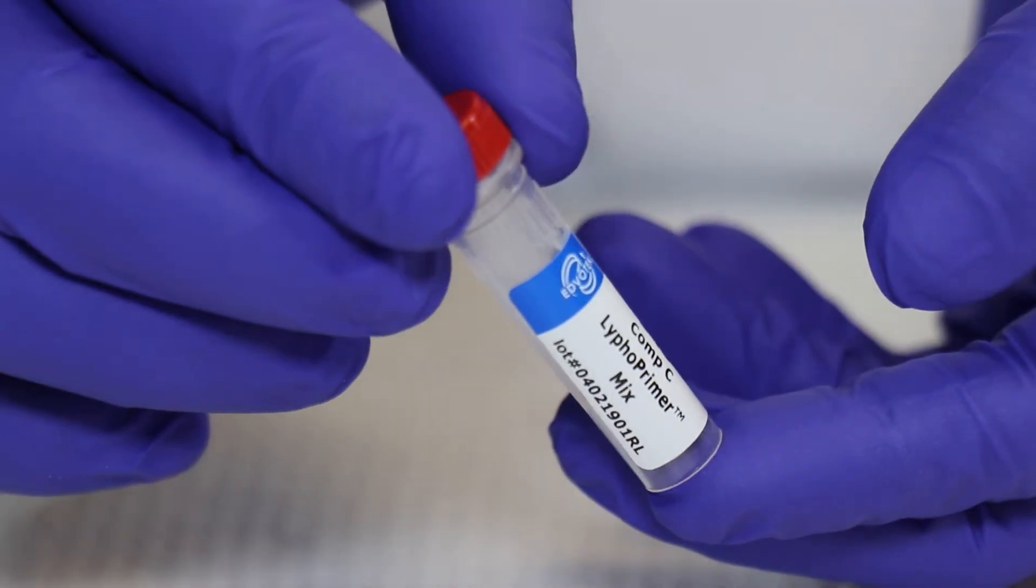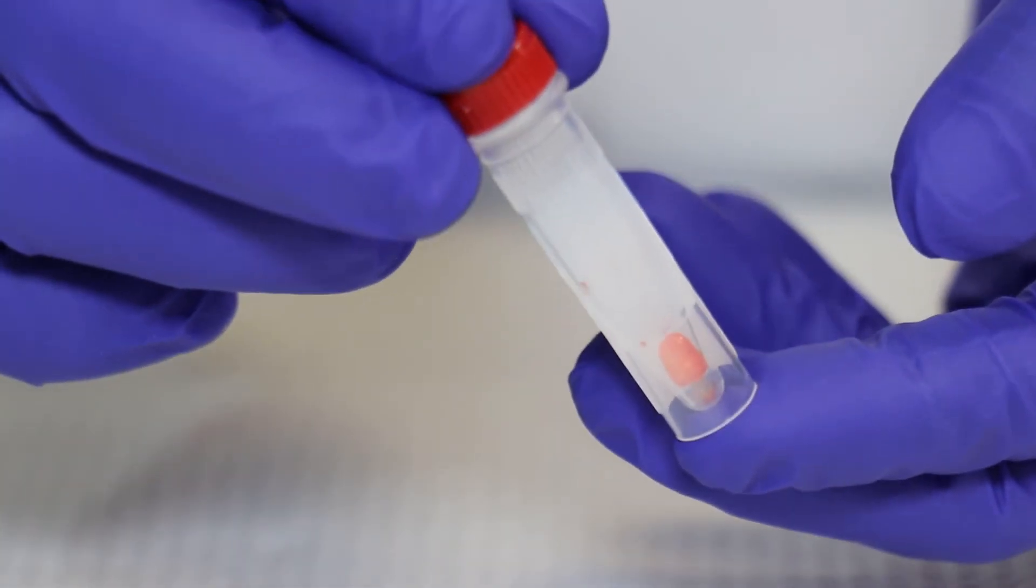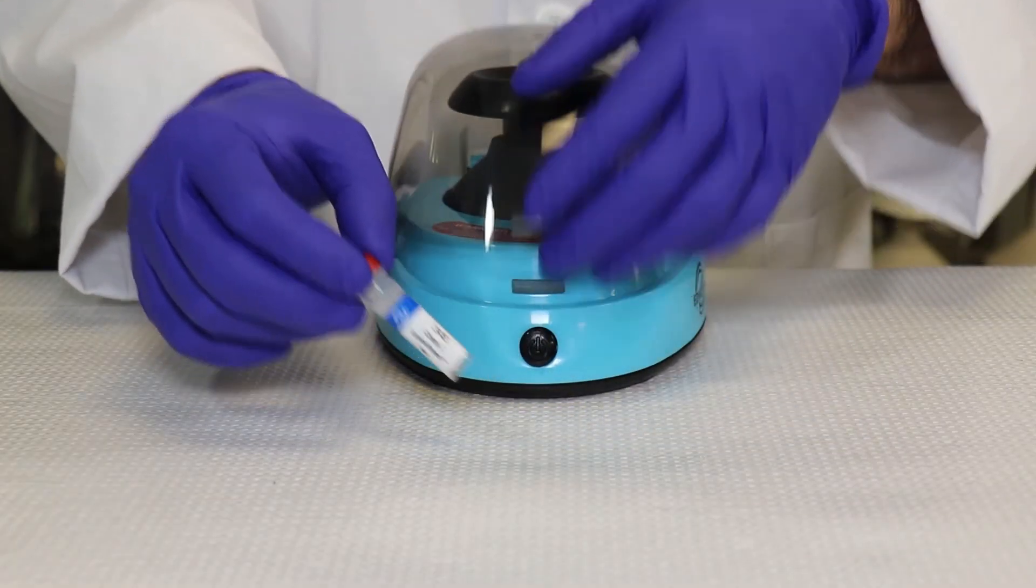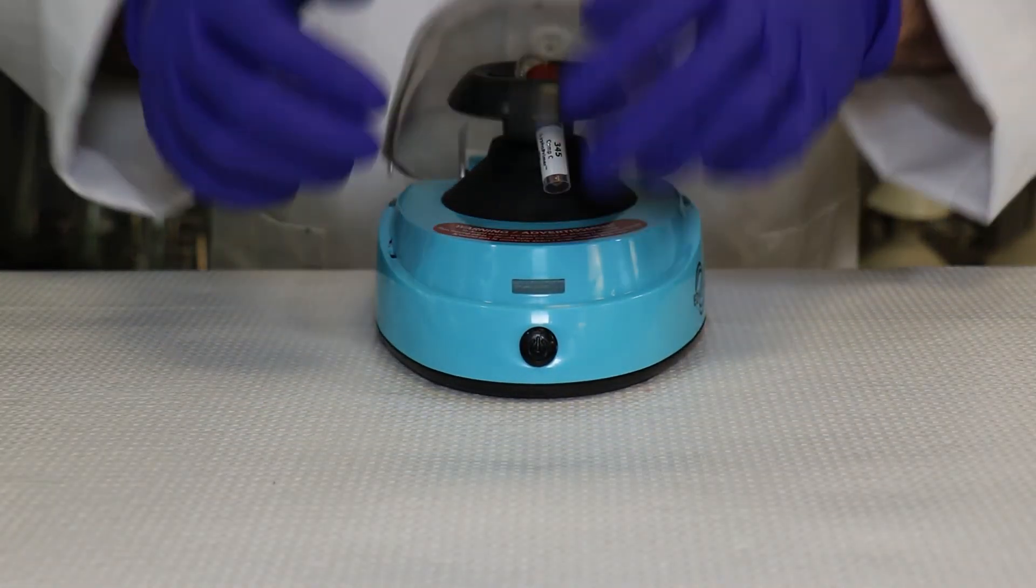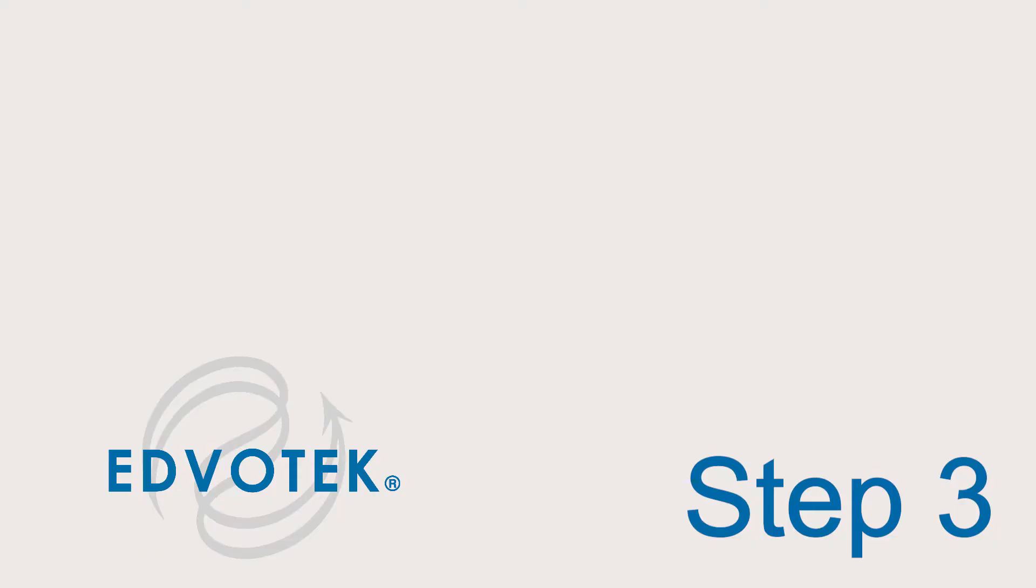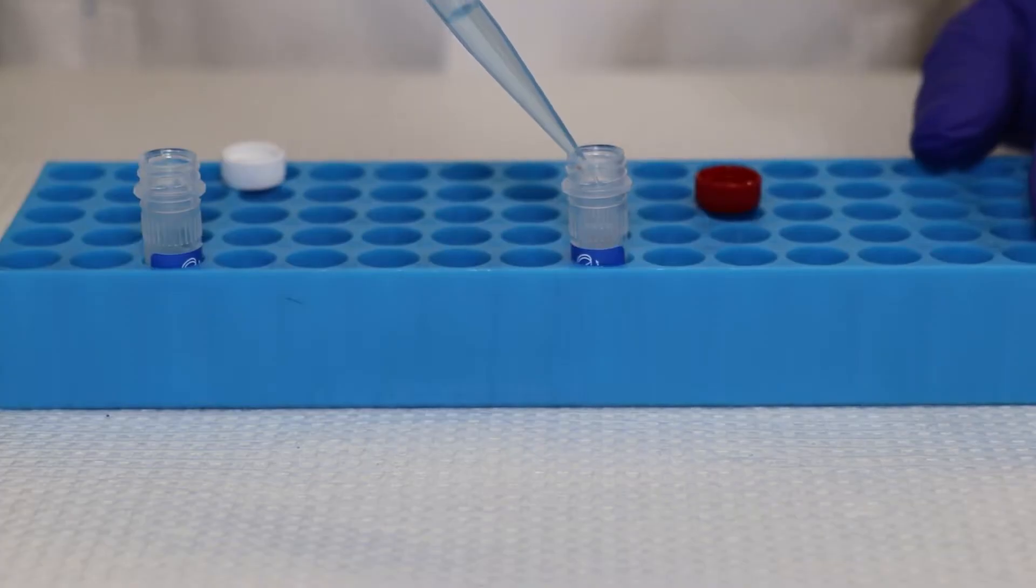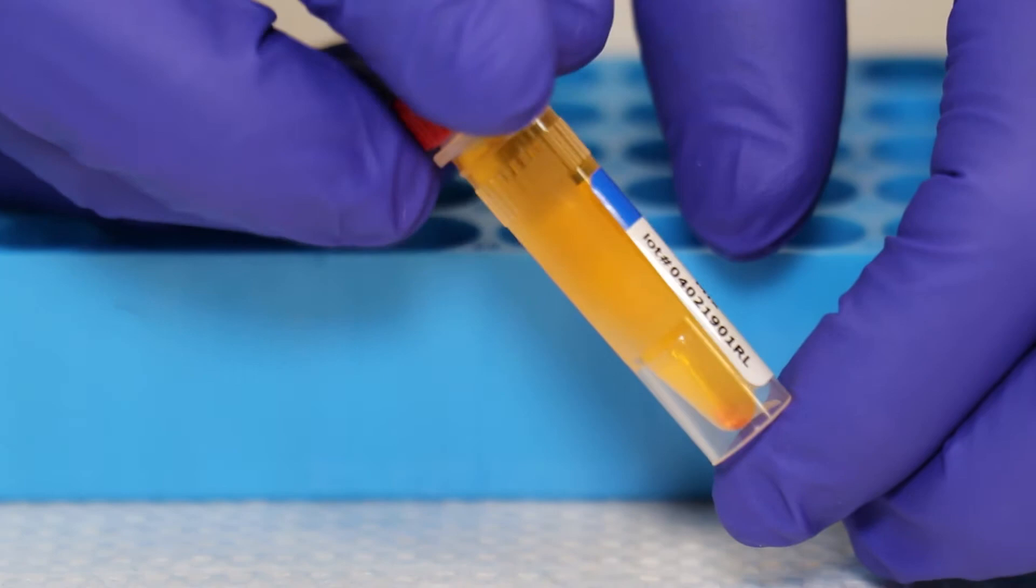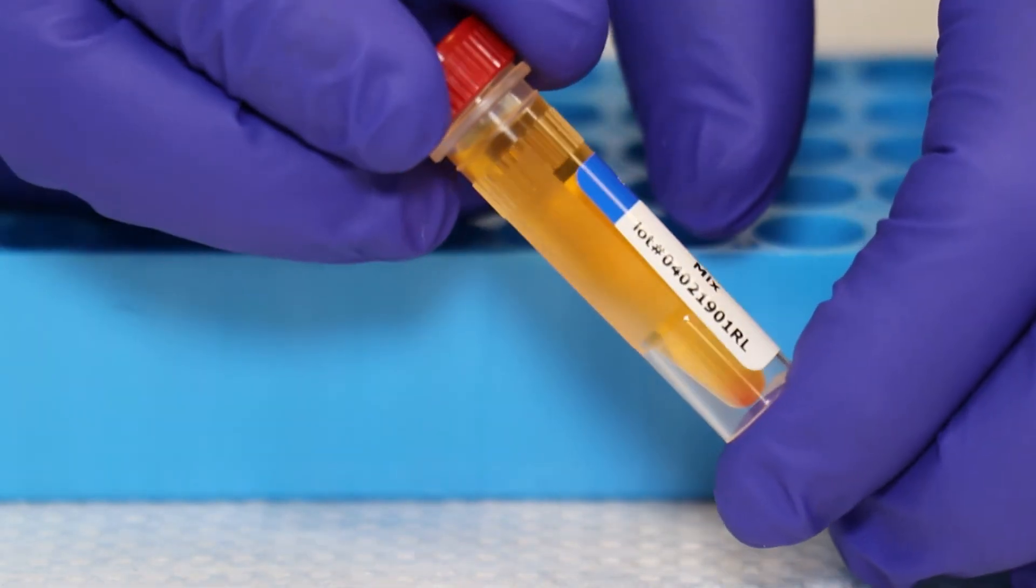Step 2: ensure that the lyophilized solid is at the bottom of Component C lyophilized primer tube. If not, centrifuge the tube at full speed for 10 seconds. Step 3: add 1.2 milliliters of Component B TE buffer to the lyophilized primer tube, cap and mix well, then place on ice.